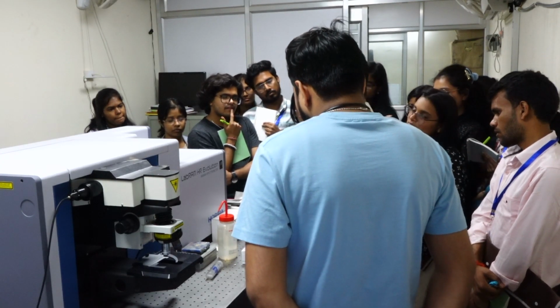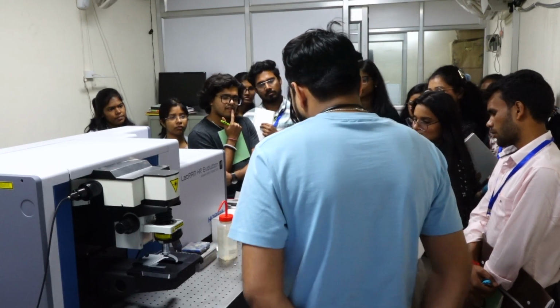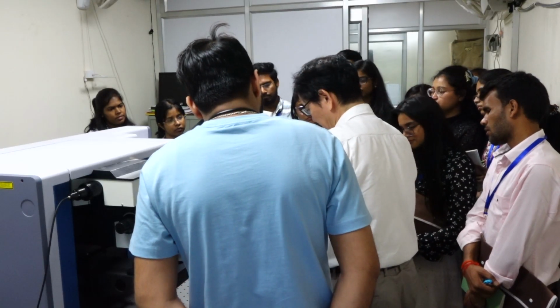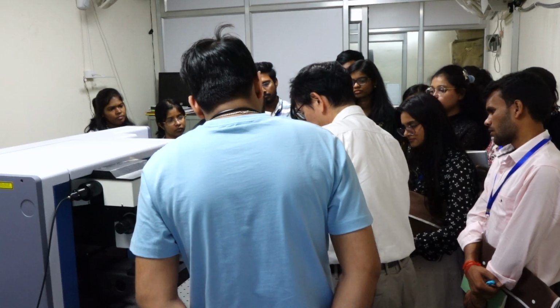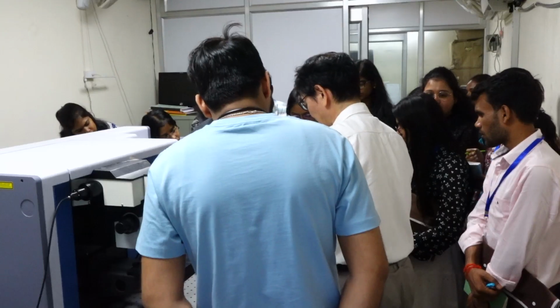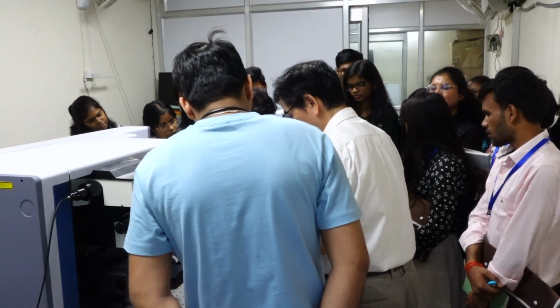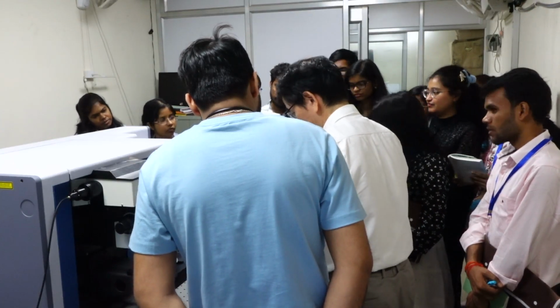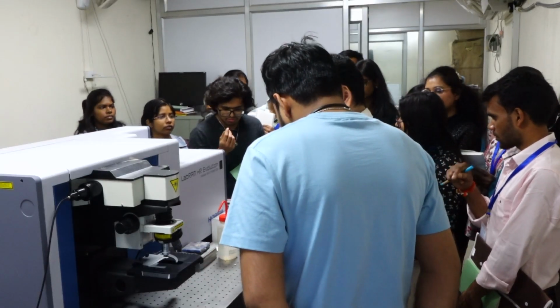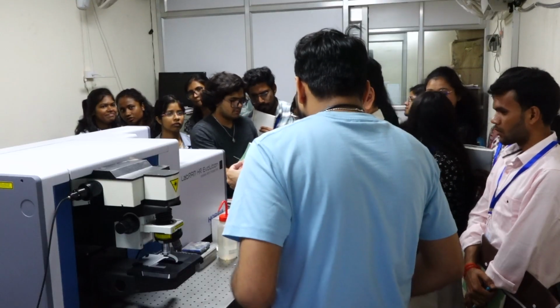So it's preferable if we can measure a smaller volume. Then I brought capillary glass. This is a glass tube. Okay, you touch. Not a special one, just capillary glass. Then put one drop, tap, and move it to the bottom.